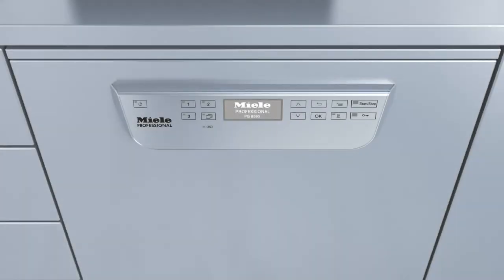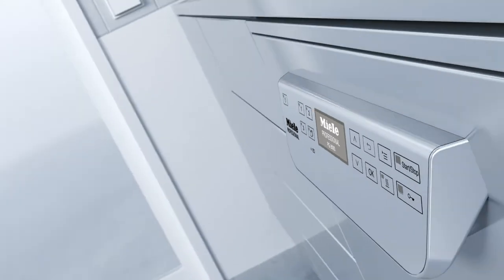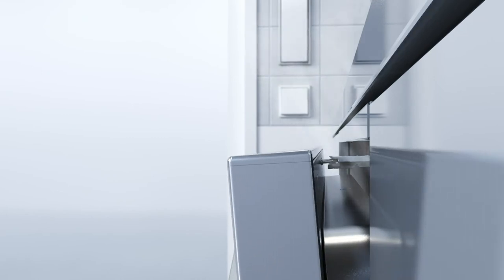The two highly efficient drying systems deployed on the new washer disinfectors are also highly convenient. On models featuring EcoDry, the door opens automatically at the end of a program, thanks to AutoOpen. This releases hot, moisture-laden air, allowing the load to dry and cool down faster.